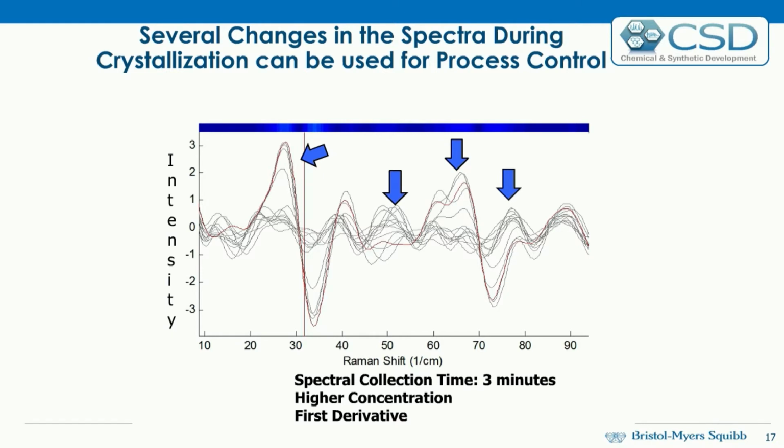Once we got the concentration up a little bit higher, then we started looking at some of the noise and eliminating that randomness. Since it is a slurry mixing and there's different sized crystals that are formed in it, and obviously it would have to be milled later, but you can see using first derivative, we can easily clarify what peaks we should monitor. So many times we will do a pre-processing of data by taking the first or second derivative to clean the spectra up and narrow down what spectral bands we want to look at.